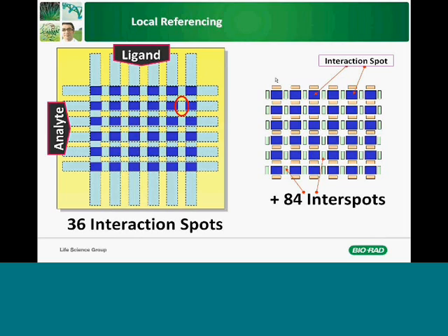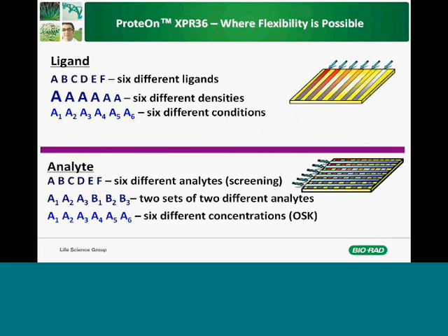And the last slide for the introduction is just to show a few things that I could think of about the flexibility of the ProteOn. So it's not just a matrix of 36 spots. The main thing, in my opinion, is the flexibility that it gives you.